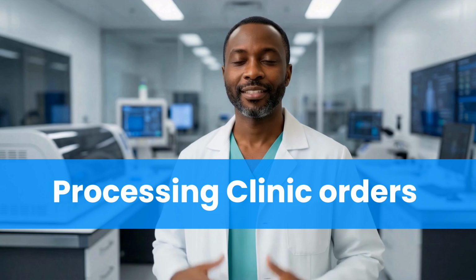We've just gone through how to process an order for a test by a walk-in patient, but orders can also come from the main GoodMedico app when a clinic orders a lab test for a patient. Let me now walk you through how to process those.